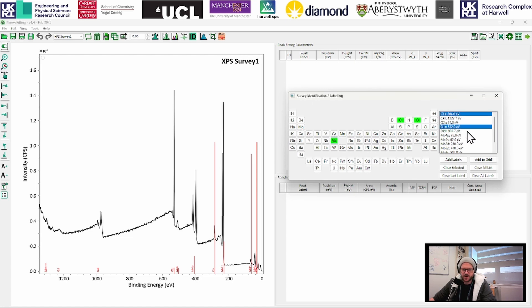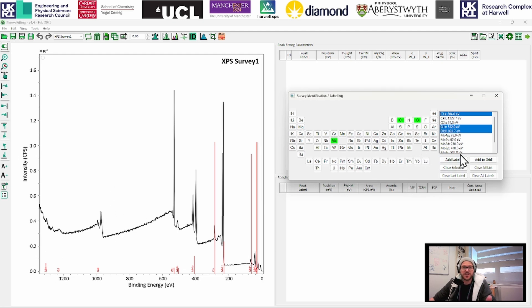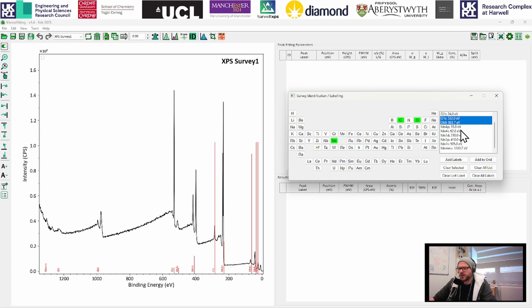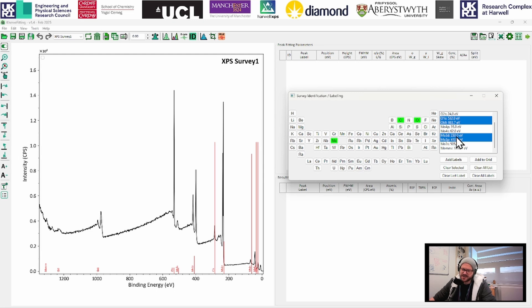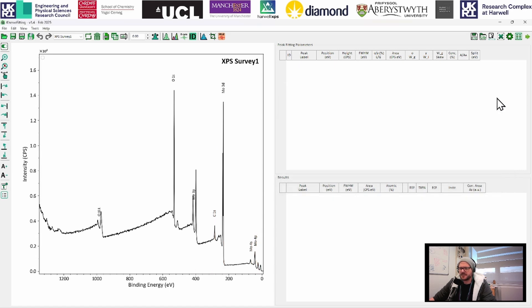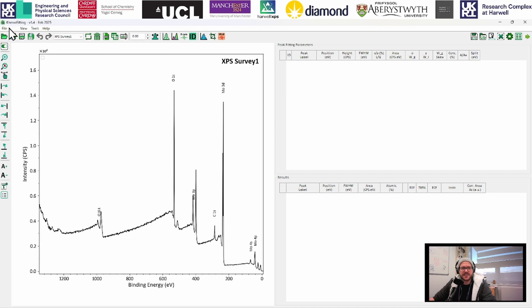So I'm just going to label the main peaks here. So I've got carbon 1S, the oxygen 1S. I'm also going to label the oxygen KLL because that's pretty sizable. So if I was showing this survey to identify what was in a sample, I might say, well, look, this is a pretty major peaks. I'm going to label this as well. We're going to label the 3D and the 3P. And yeah, we'll go ahead with the 4S and the 4P as well. And I'm just going to click on add labels. And then we can just clear selected and close this down.